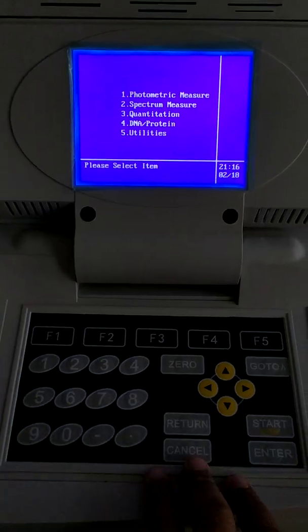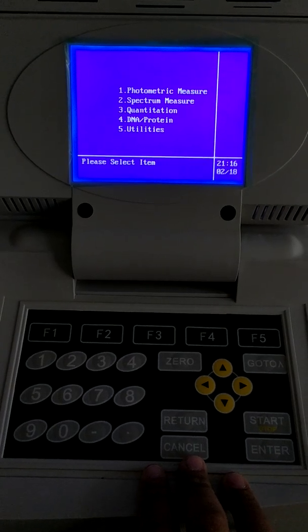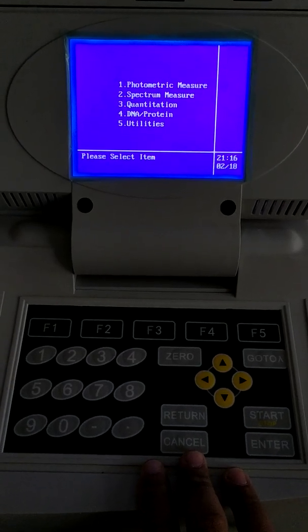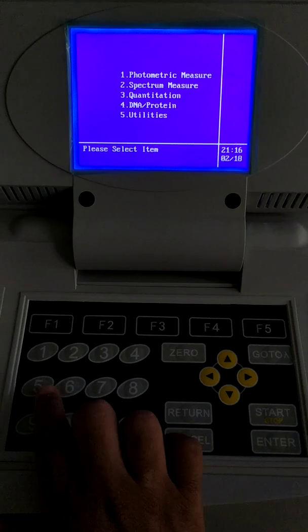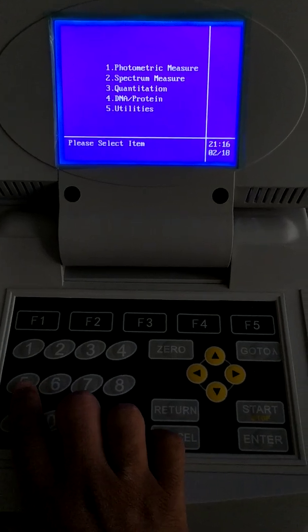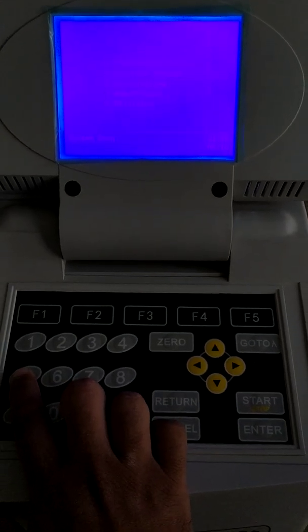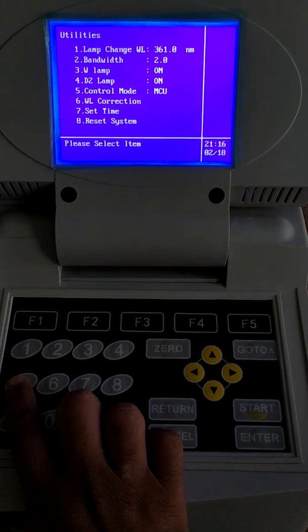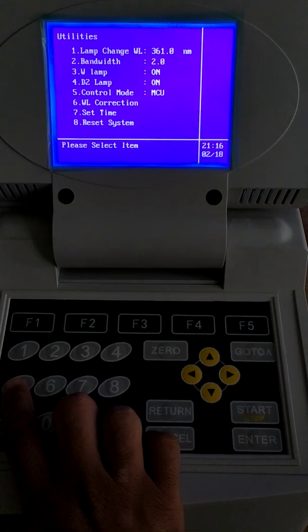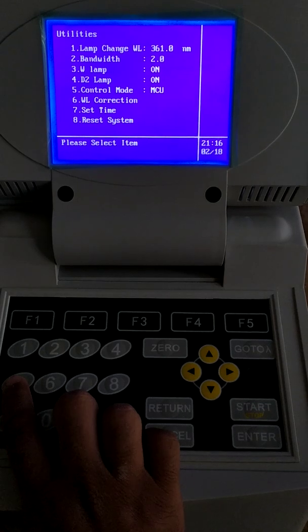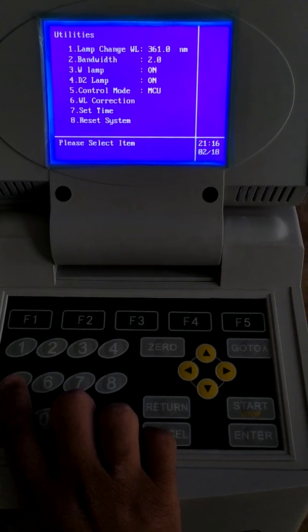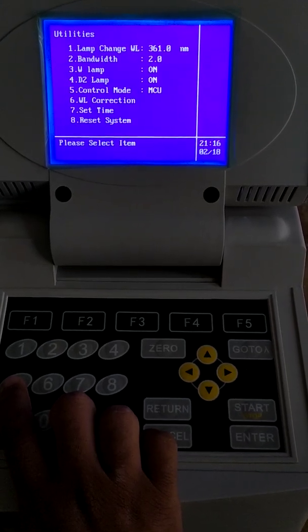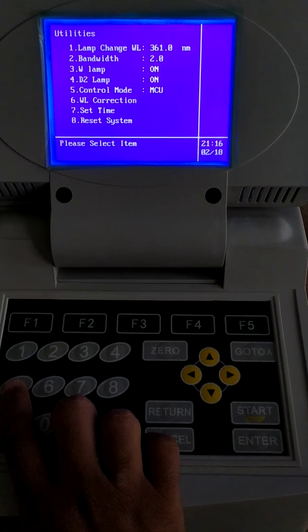In the main menu for controlling the instrument through PC, go to utilities and press 5. Then select control mode by pressing 5 again. The instrument is currently on main control unit mode.